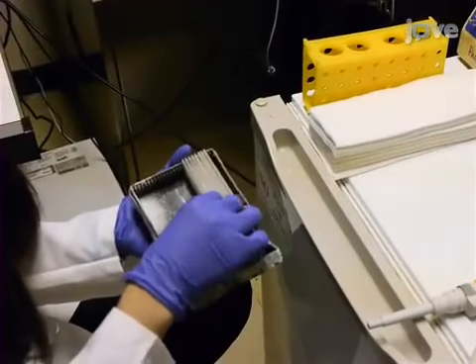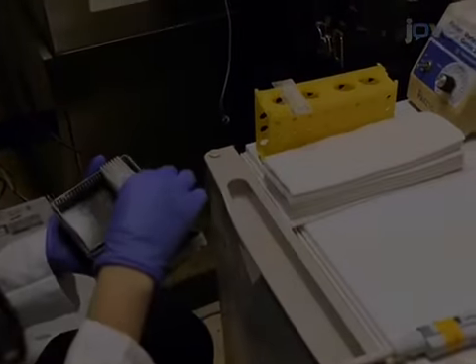Immediately prior to microdissection, let frozen slides thaw for 10 seconds.